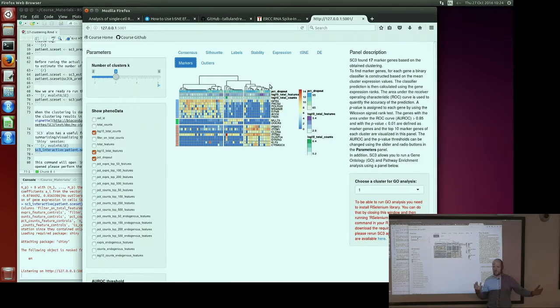Now you have hundreds of replicates, right? But they still require you to use 2 groups. So here, because we didn't want to do pairwise comparisons between the groups, that was the easiest way to define differential expression. So it's different from the context of classical differential expression. Yes.